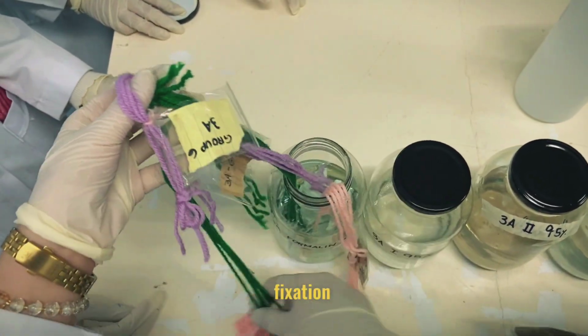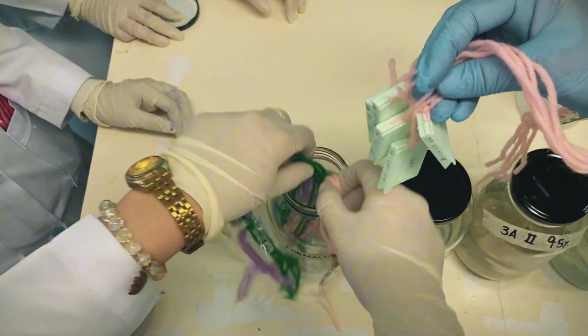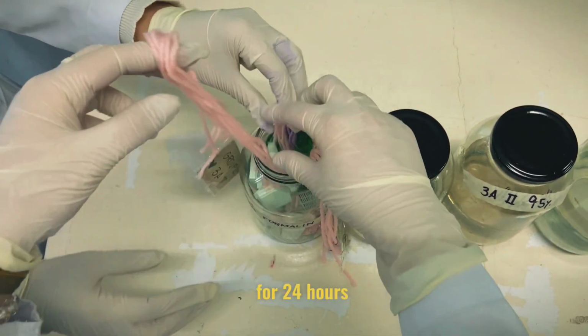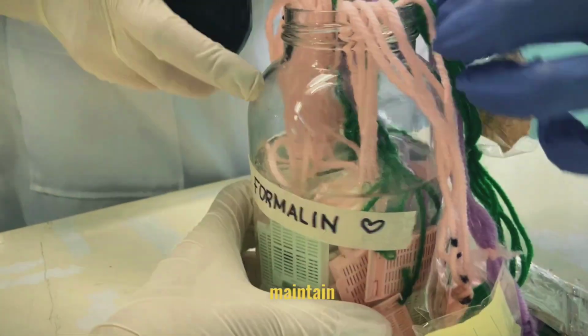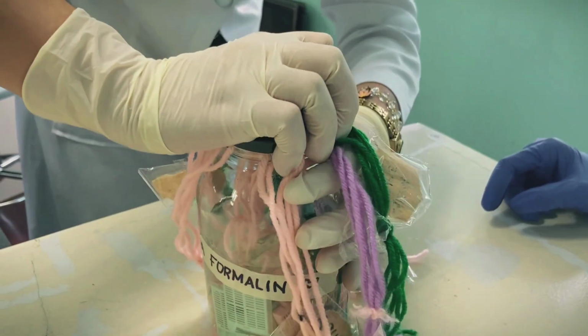Now, it is time for fixation. Submerge the tissue in a fixative solution, typically formalin, and let it fix for 24 hours. This process preserves the tissue and prevents degradation, ensuring that we maintain cellular structures for further analysis.